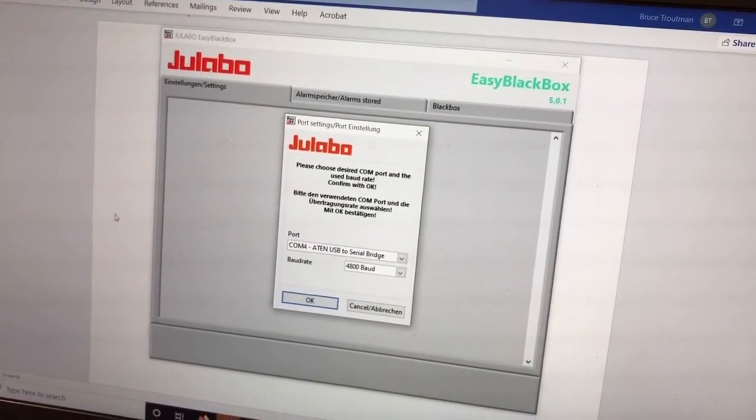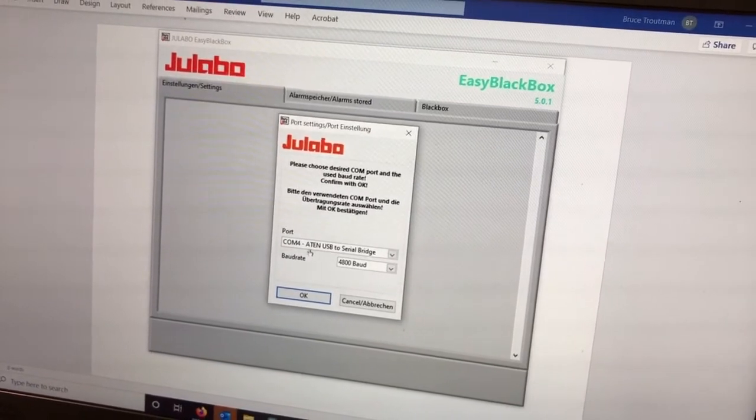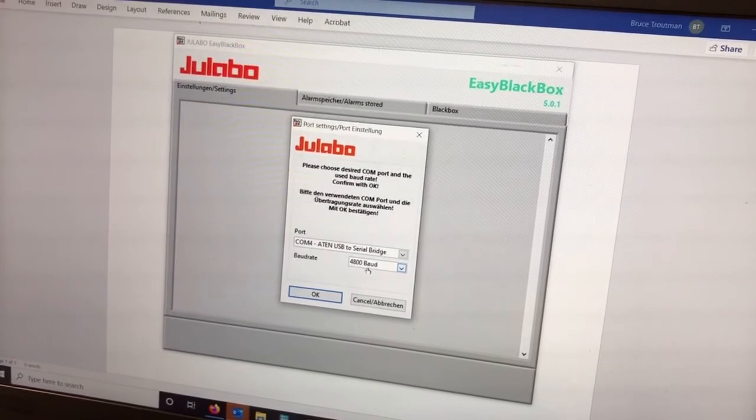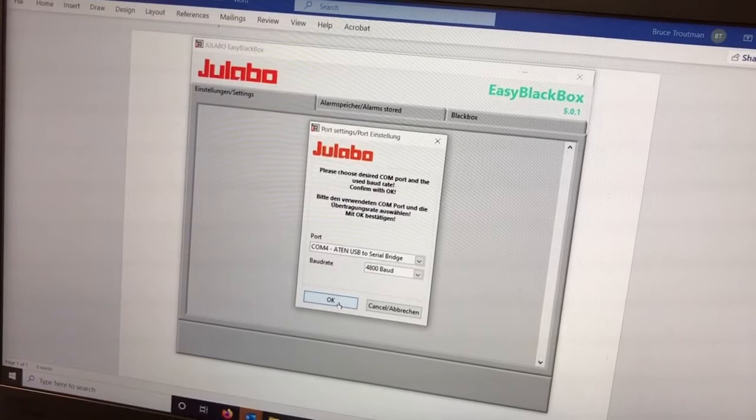You have clicked on the Easy Black Box icon to open up the Easy Black Box program. Make sure you have the correct COM port selected and also that your baud rate in the program matches the baud rate of your instrument.